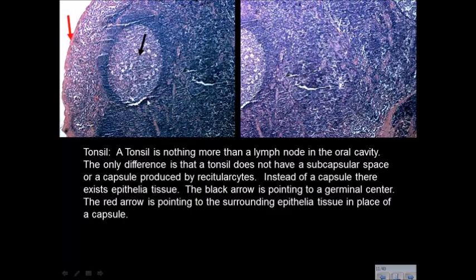Okay, now this is different. This is definitely a germinal center. B cells in here, outside here will be some T cells. And at this magnification, I really can't tell what I'm in. I don't know if that's a capsule or what it is. I'm saying that because tonsils are histological lookalikes. Just looking at this magnification, I can't tell if it's a tonsil because they look alike. Here are some sinusoidal capillaries up here, toward the medulla.